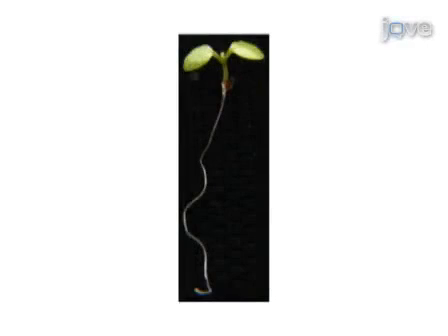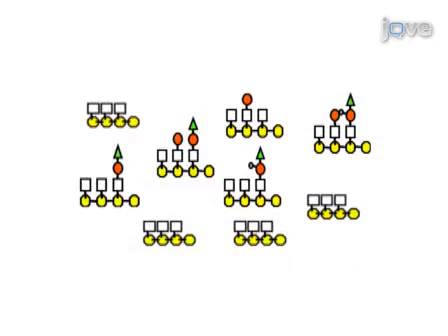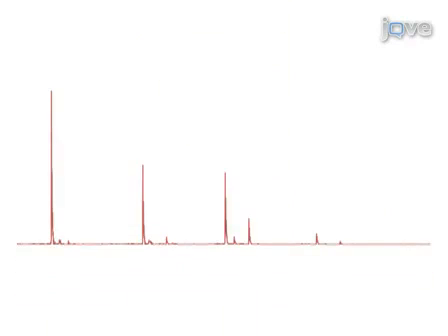In the case here, cell walls are prepared from plant seedlings by first removing cellular components with 70% ethanol. The target wall polymer is next digested with a specific hydrolase, solubilizing particular wall components in the form of oligomers. An alternative approach is to digest the cell wall with the enzyme in situ directly on the tissue. The relative abundance of the released oligomers is determined by MALDI-TOF mass spectrometry and statistical analysis.